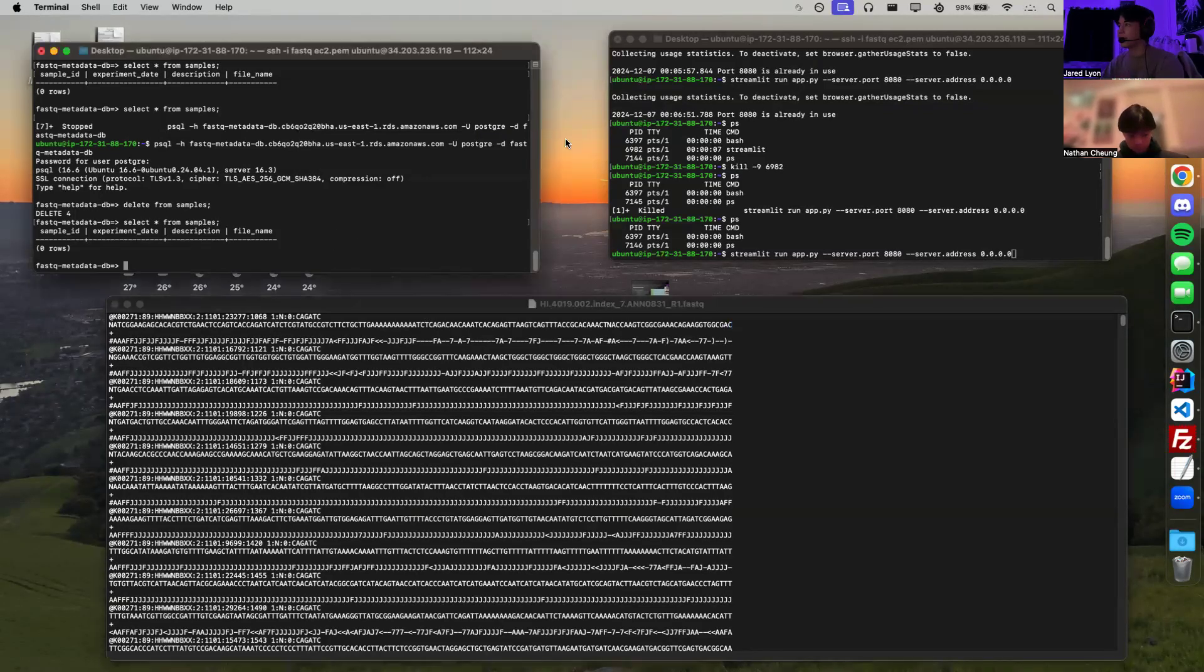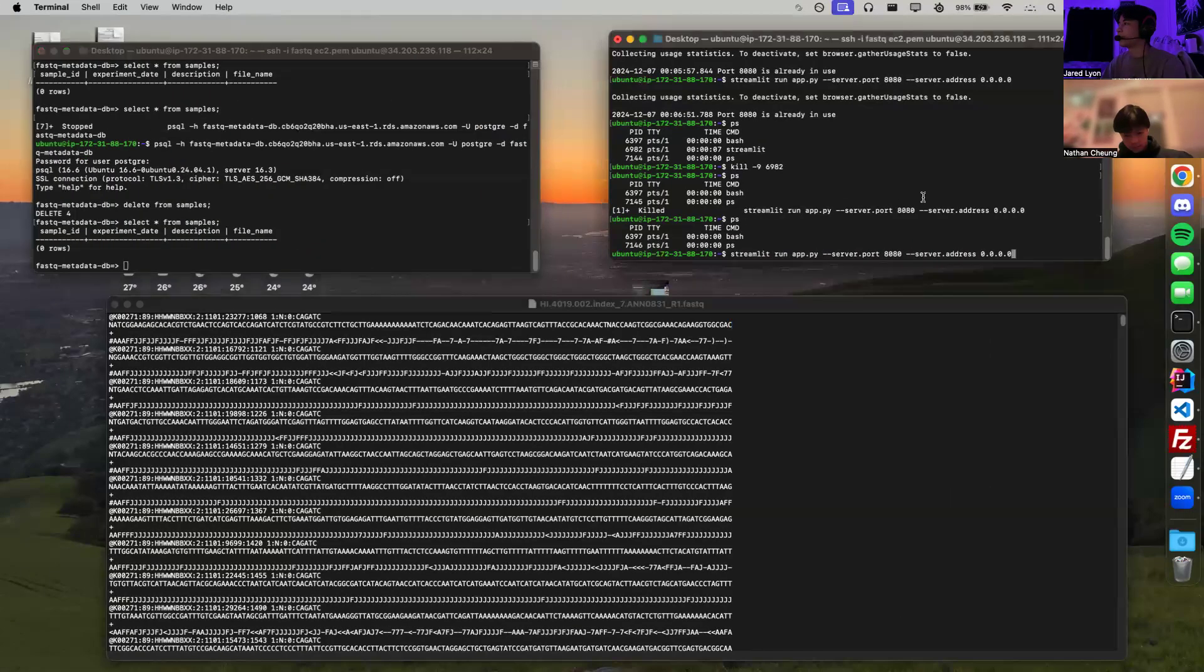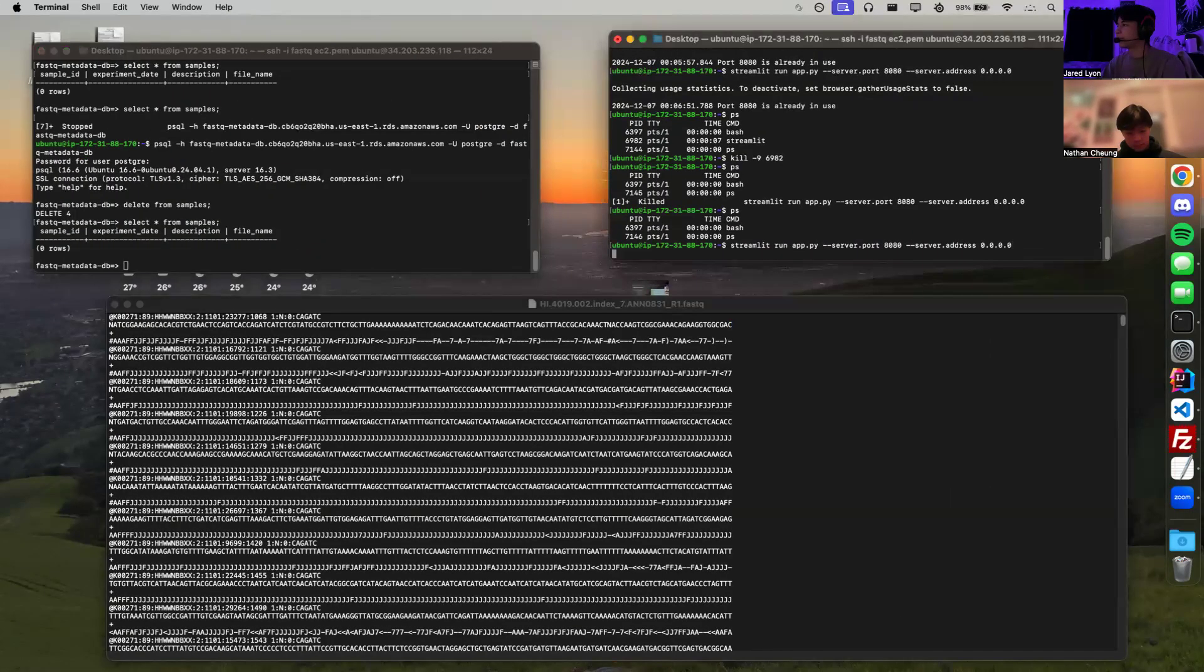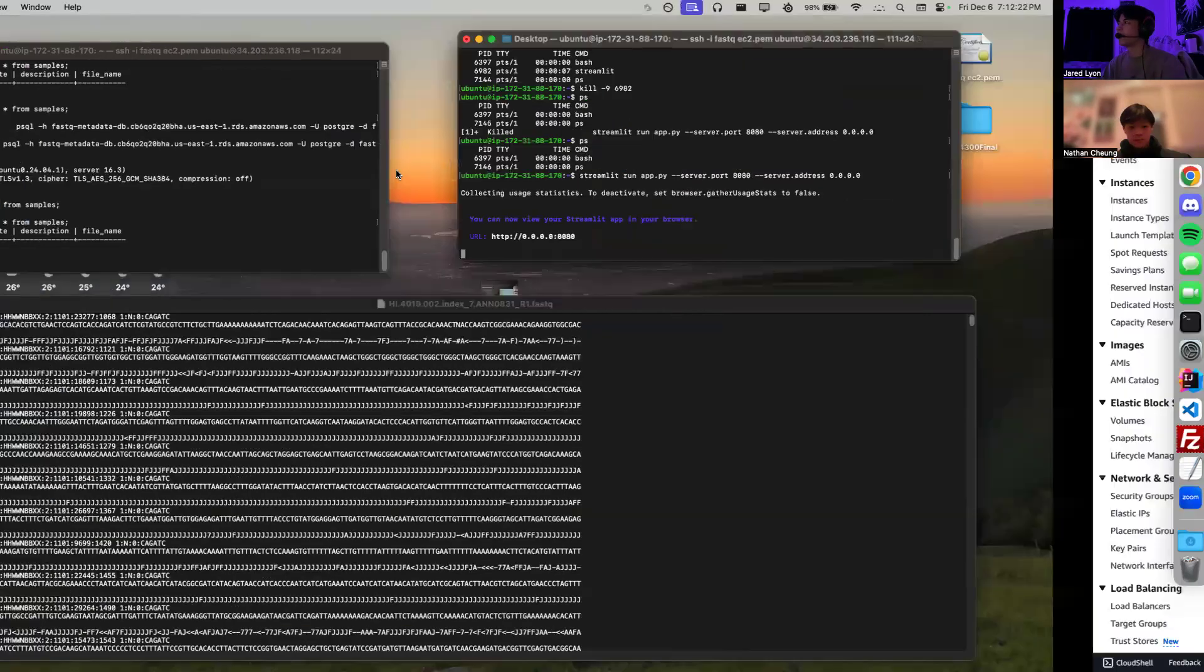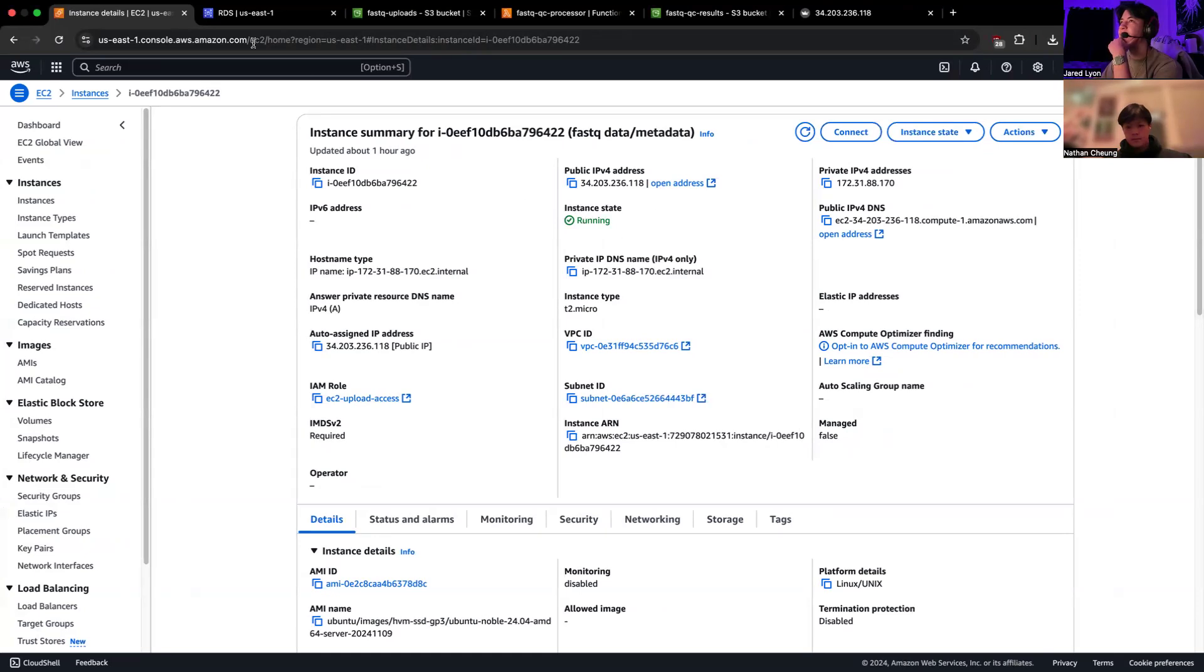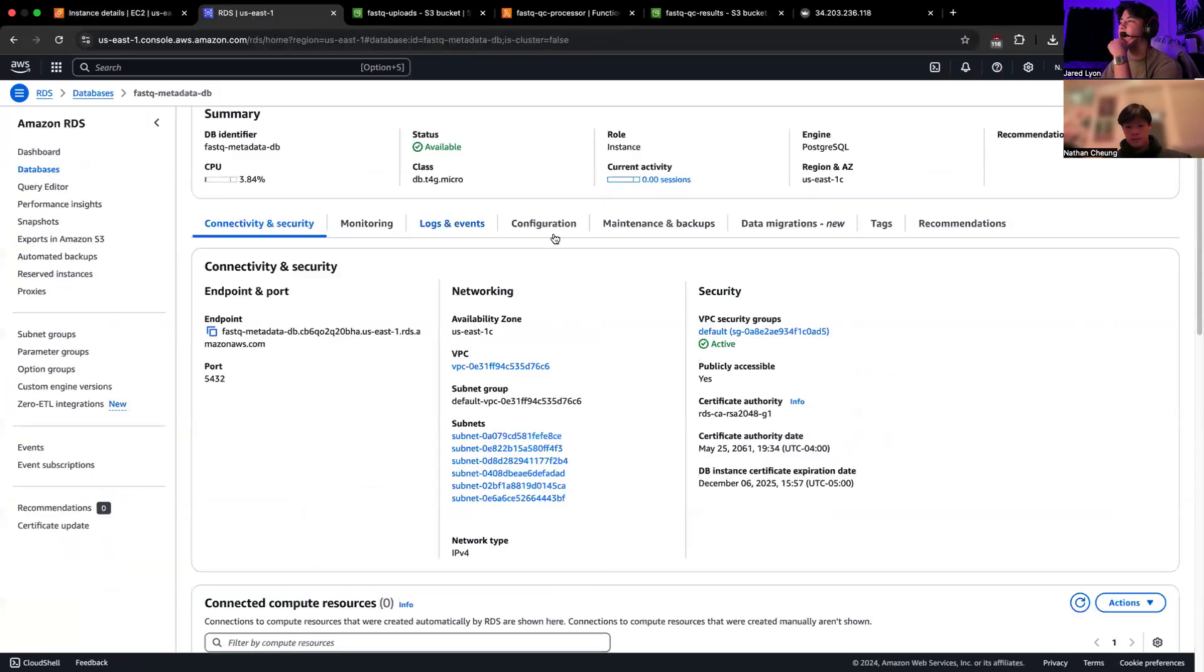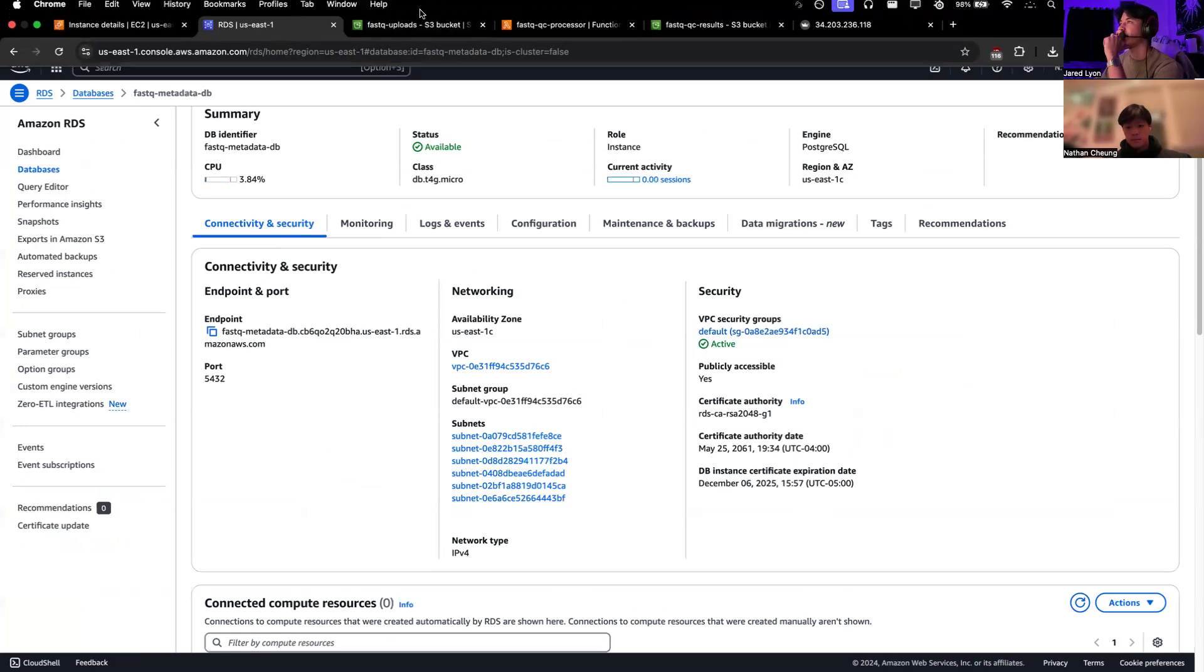So if we start over here, we're actually going to start our app real quick. And there we go. Our app has started. And then we can go over here, and you see our EC2 instance, which is running. This is where the Streamlit app is running. And then our RDS instance, which is active right here. This is a Postgres implementation that'll hold our metadata.